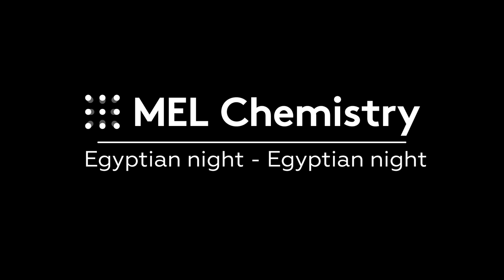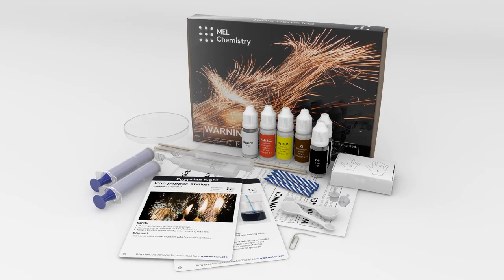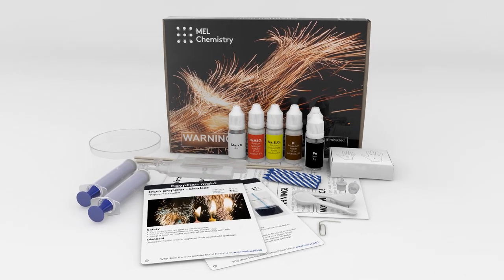Welcome to the wonderful world of chemistry. Today, with the help of the Egyptian Night Set by Melchemistry, we will obtain a solution which suddenly changes its color.